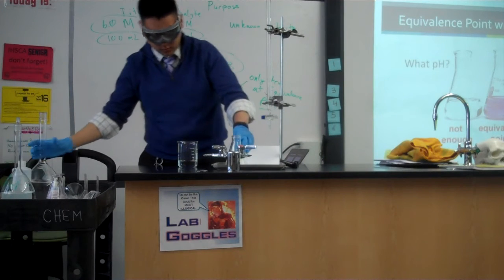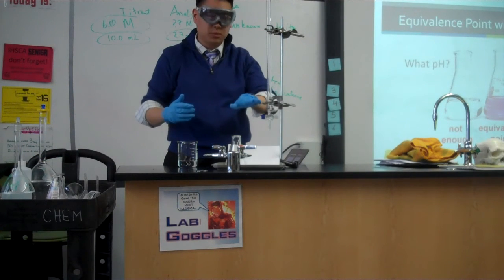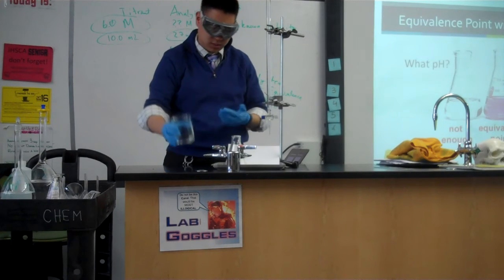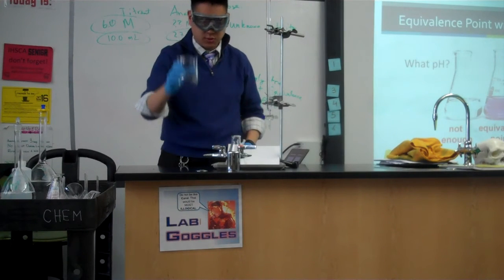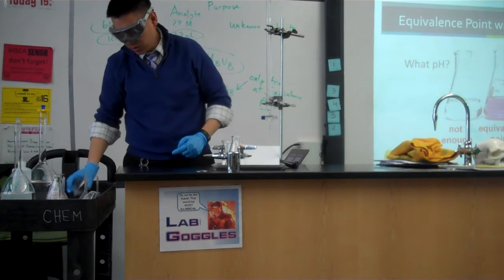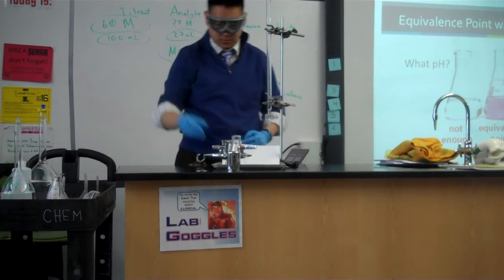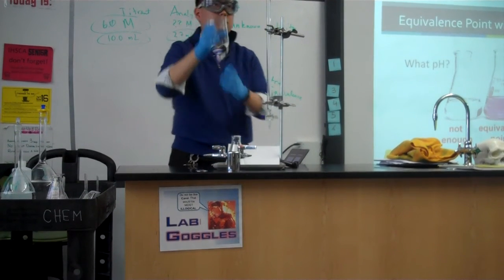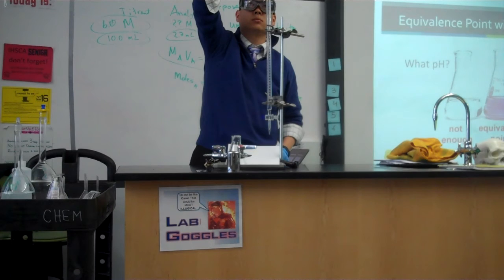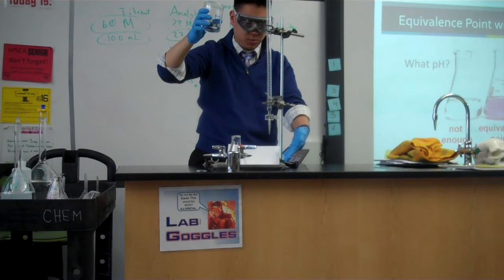How much of that are we going to need? This burette only holds a maximum of 100 milliliters, so you don't want to exceed more than that. So you have your titrant here. Now, to reduce spillage and splash, you're going to put a funnel on top, and pour slowly and carefully into the burette, making sure that this stopcock is closed. Otherwise, it's going to pour out on your table.